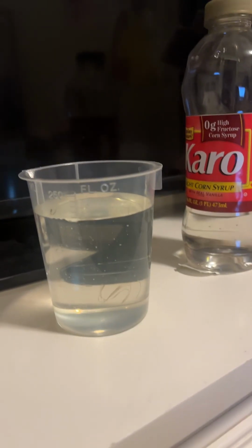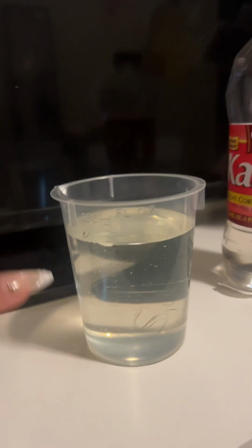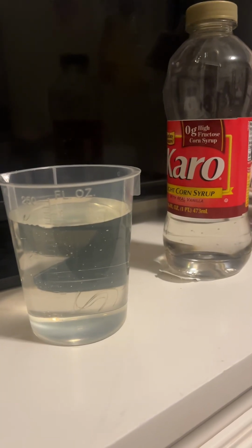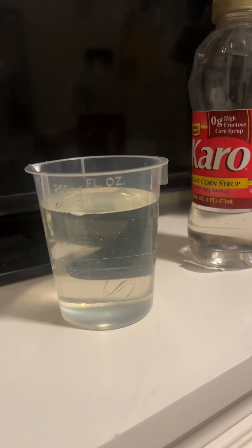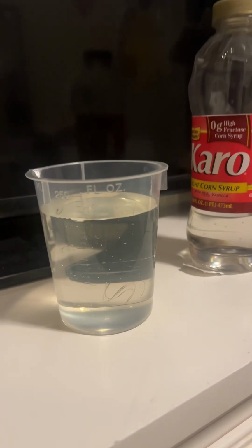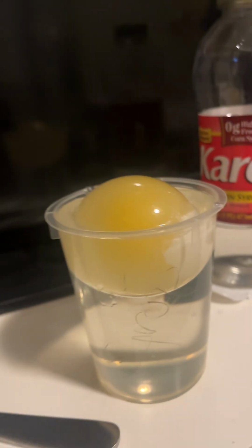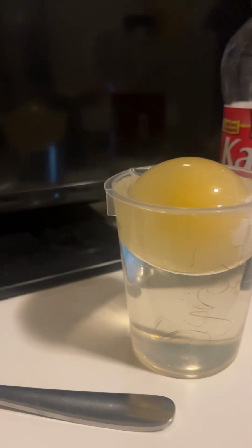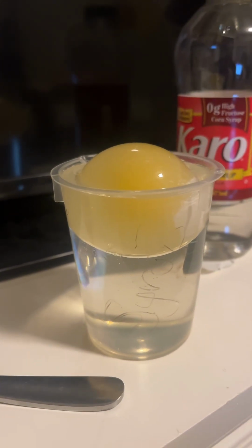All right, now that we recorded our observations on our lab report sheet, we are going to do the next step, and we're going to do the syrup. All right, so I got a new beaker and we measured it to 200 milliliters of the Karo clear corn syrup. So now we're going to wash our egg carefully. I'm going to place the egg in it. All right, now we put the washed egg in the syrup, and now we wait for another 24 hours. So yeah, we'll see you guys tomorrow.